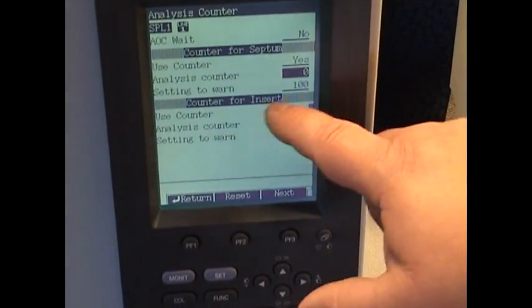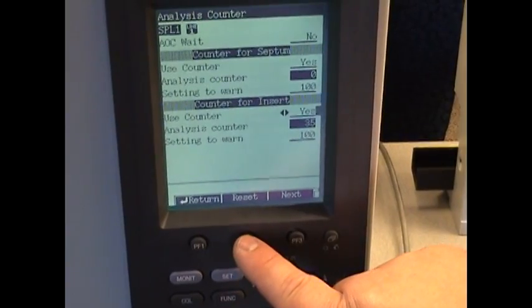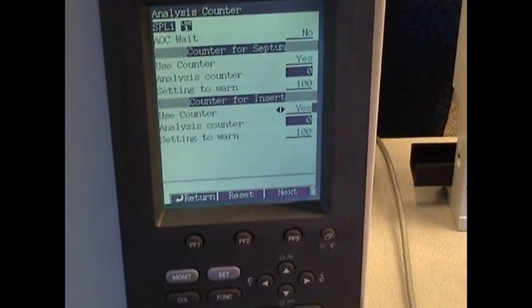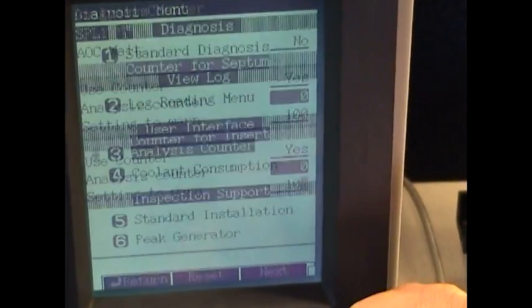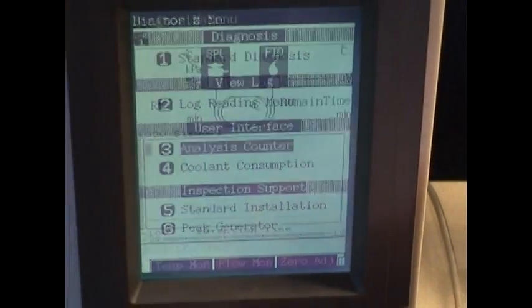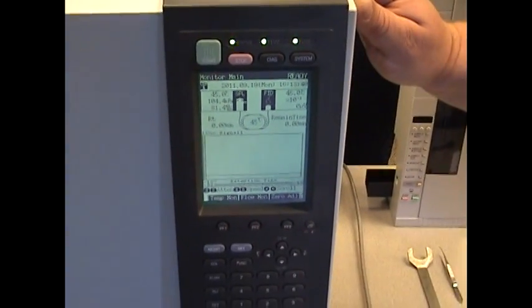Do the same thing down here for counter, insert. It says 35. I'm going to go to reset. We're at zero. I hit enter to accept everything. Now I can hit return. Monitor. And there you go. It's good for another 100 injections before you get the error again.